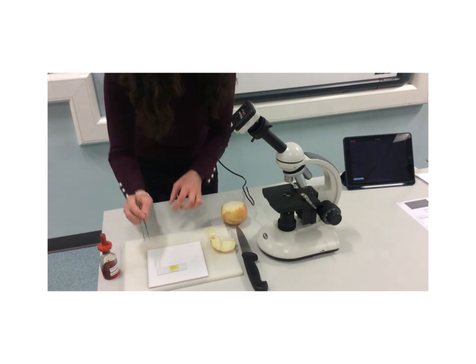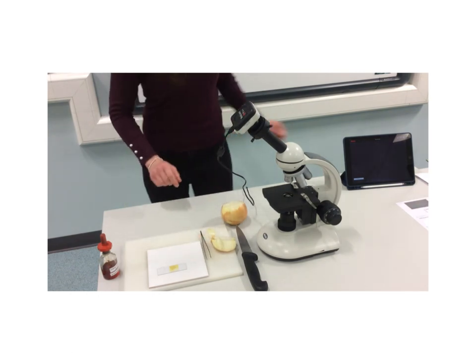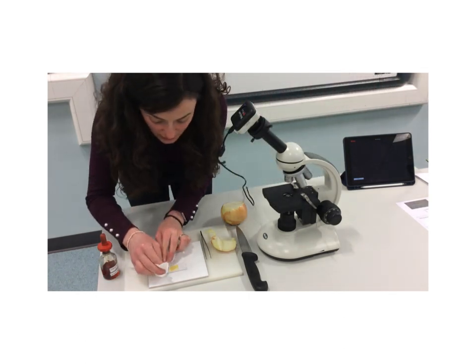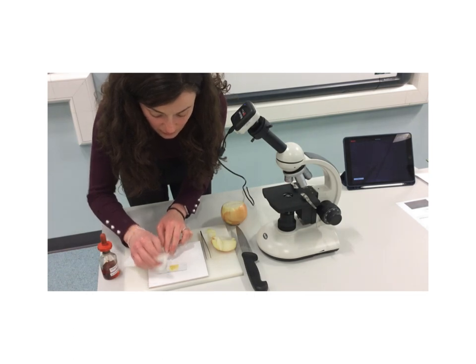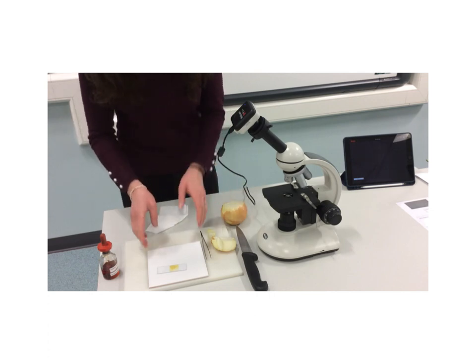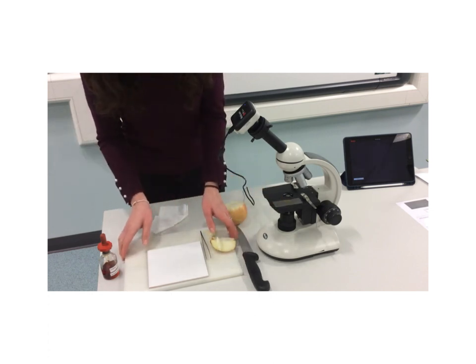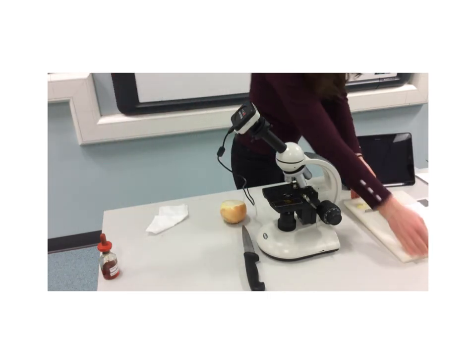Okay. Now, hopefully you can see that is now done. I'm just going to wipe up a little bit of the iodine from the edges, in case any of it spills. So now let's have a look to see if we can see these on our microscope. I'll set this up here. I'll clear this out of the way so that then we can get the iPad.